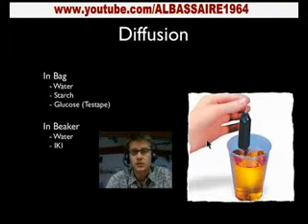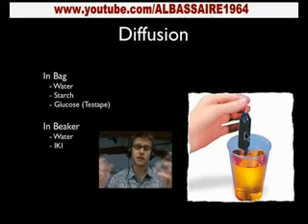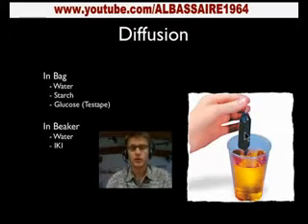In the bag to start with, we have water. We also have glucose. Glucose, remember, is a monosaccharide, and we make sure that we know it's there by testing it with something called test tape, and it shows the presence of glucose. It's a way that we can actually diagnose diabetes. And then we also test outside, and we can show that there's no glucose before the experiment. And then the last thing we put is starch inside the bag. Now, starch is a polysaccharide. That means it's a bunch of sugar molecules attached together, so it's a massive macromolecule. So then we just let it sit. I usually start this at the beginning of class.